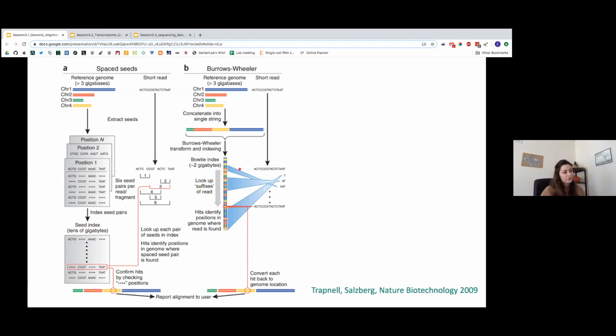So a strategy that has been used with success and initially came from algorithms that are used to compress files is called the Burrows-Wheeler transform. For example, Bowtie is based on the Burrows-Wheeler transform and is one of the mapping algorithms that we'll use the most. If you're curious about how it works, I suggest just giving a quick Google to the Burrows-Wheeler transform.